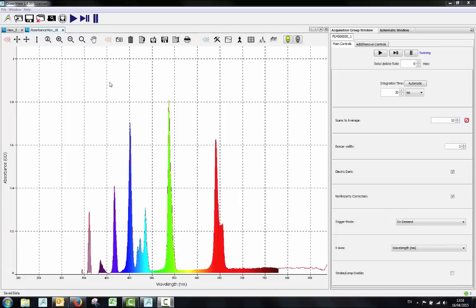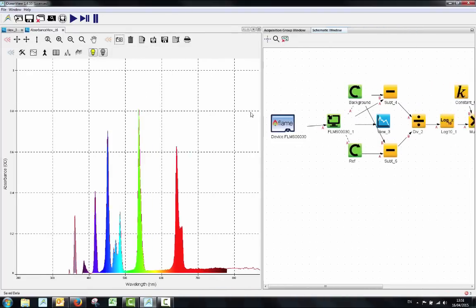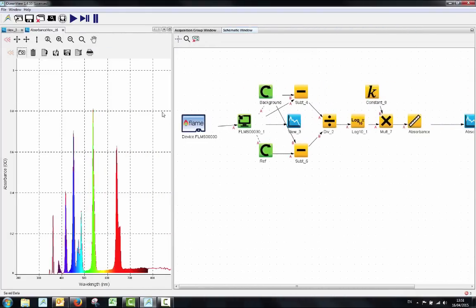You can capture the current spectrum using the camera icon at the top of the screen. The schematic window shows the functions that are being performed by Ocean View in order to get your absorbance measurement.